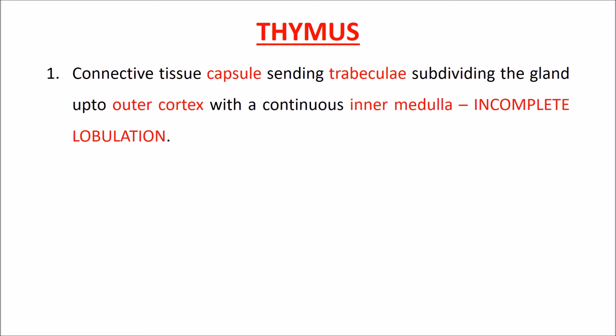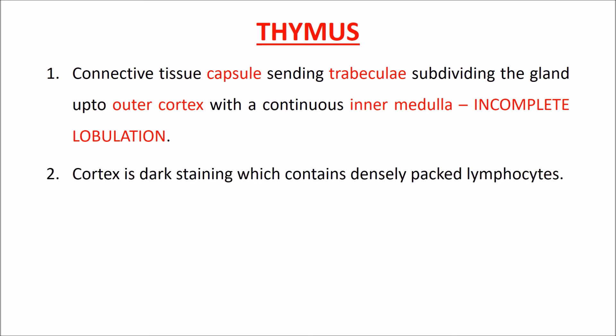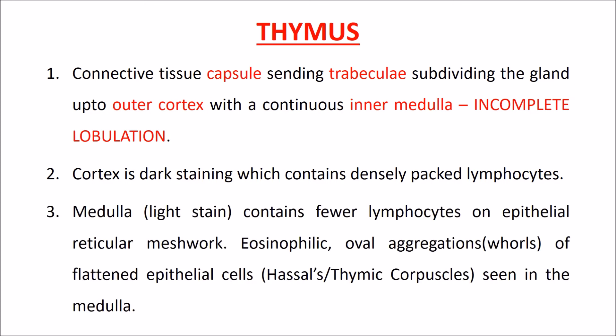A connective tissue capsule sends trabeculae subdividing the gland into an outer cortex with a continuous inner medulla — known as incomplete lobulation. The cortex is dark-staining and contains densely packed lymphocytes. The medulla is lighter-stained and contains fewer lymphocytes on an epithelial reticular meshwork. Eosinophilic oval aggregations of flattened epithelial cells, called Hassall's corpuscles, are seen in the medulla.